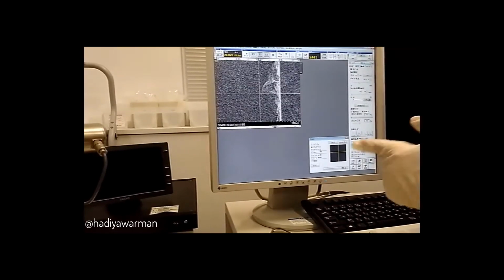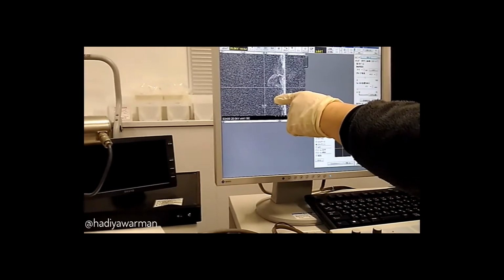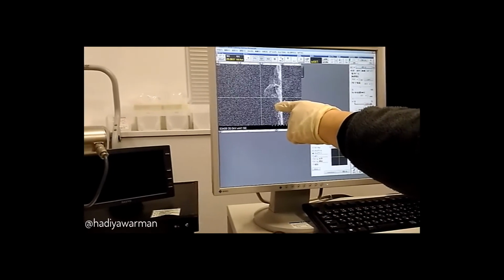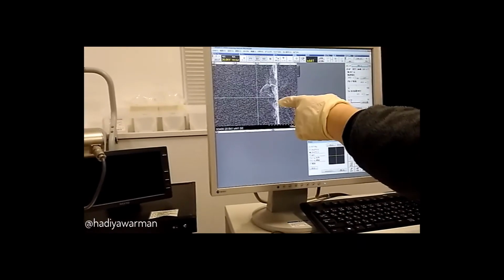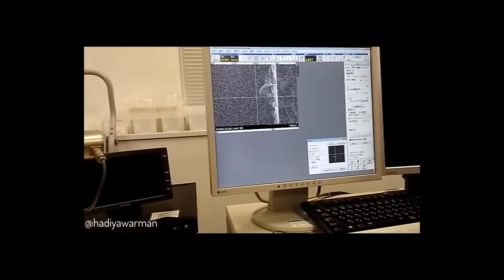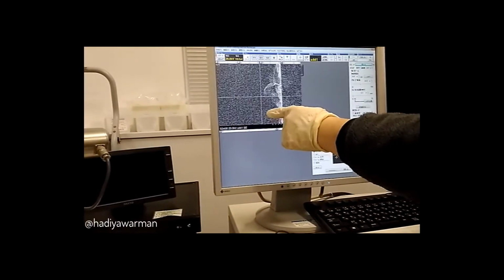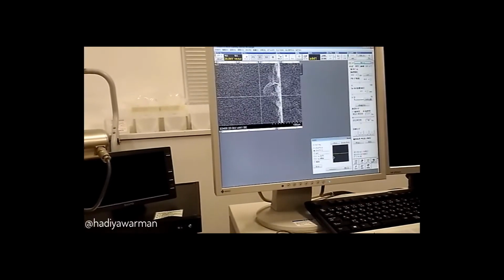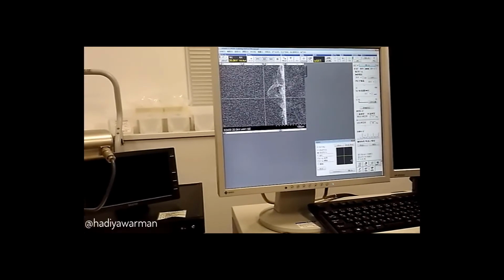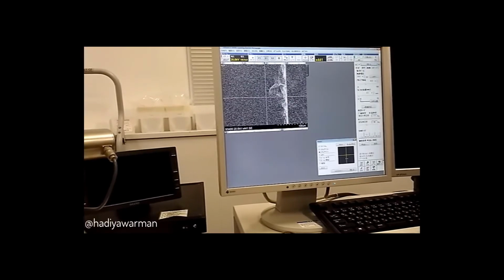And stigma X and stigma Y. You can see it's not moving so fast. Maybe it's good. Okay. So if you change the position, see, you didn't move too much. So maybe it's enough.